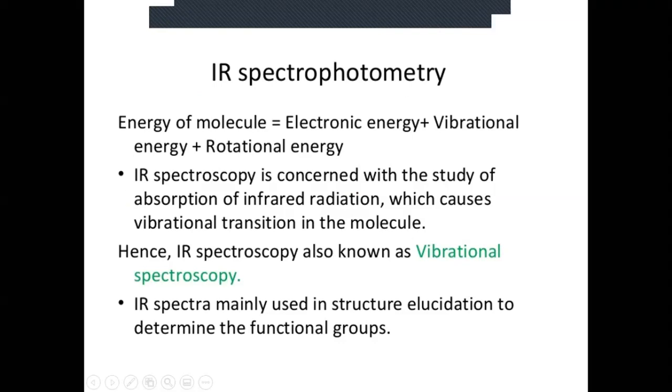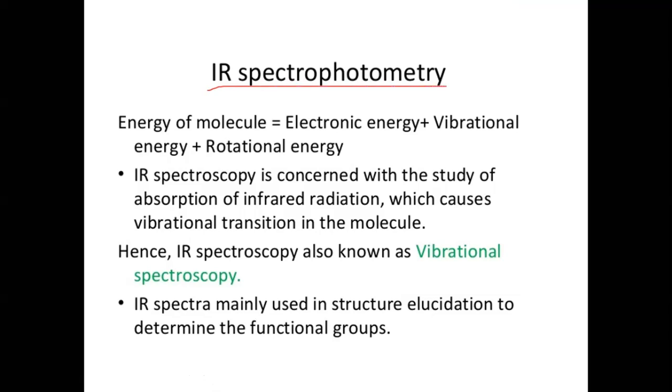Now, one way we would determine that we have made your acetylsalicylic acid is by using a technique called IR spectrophotometry. IR utilizes a particular energy of a molecule.